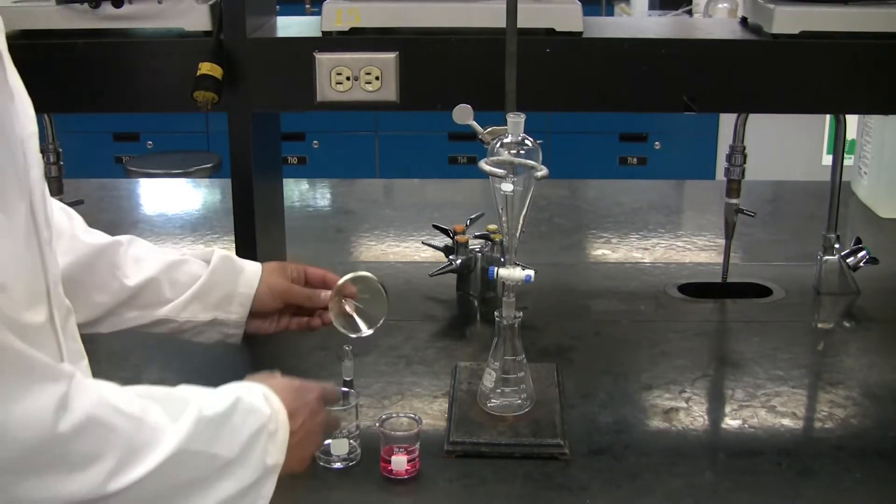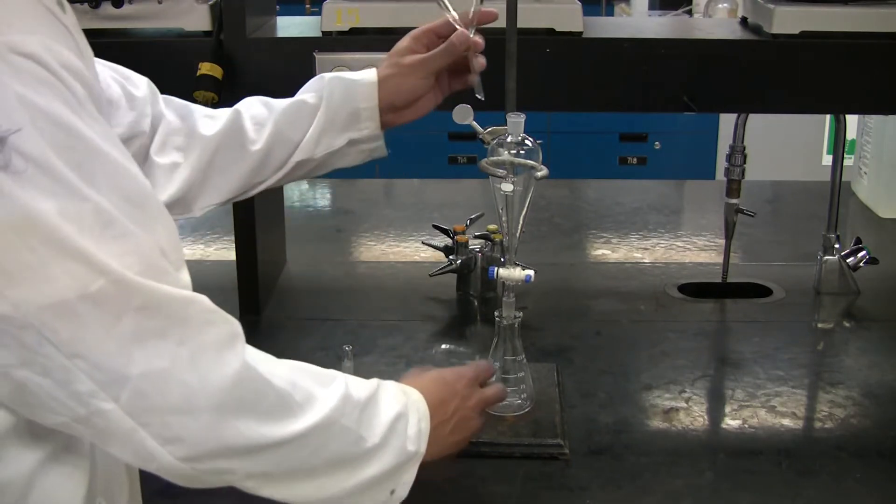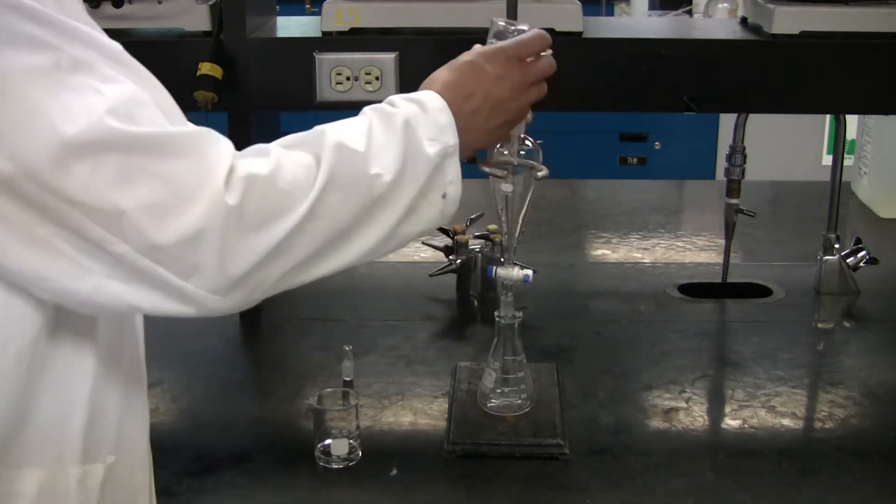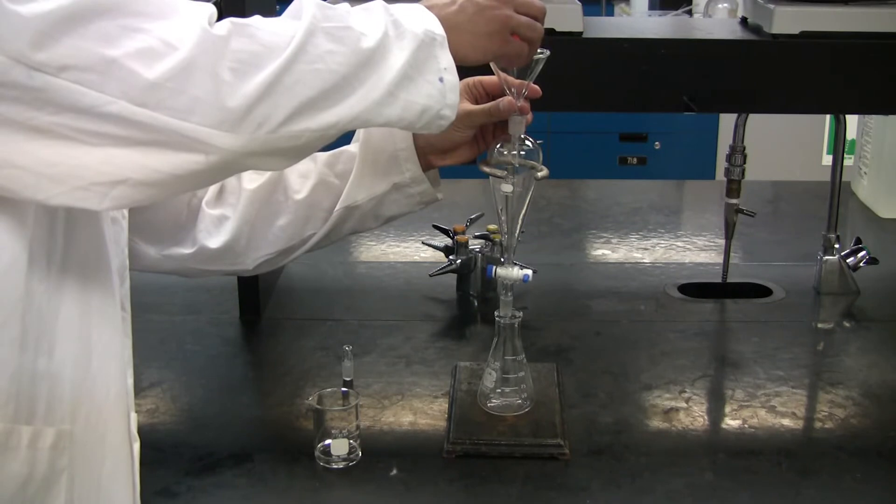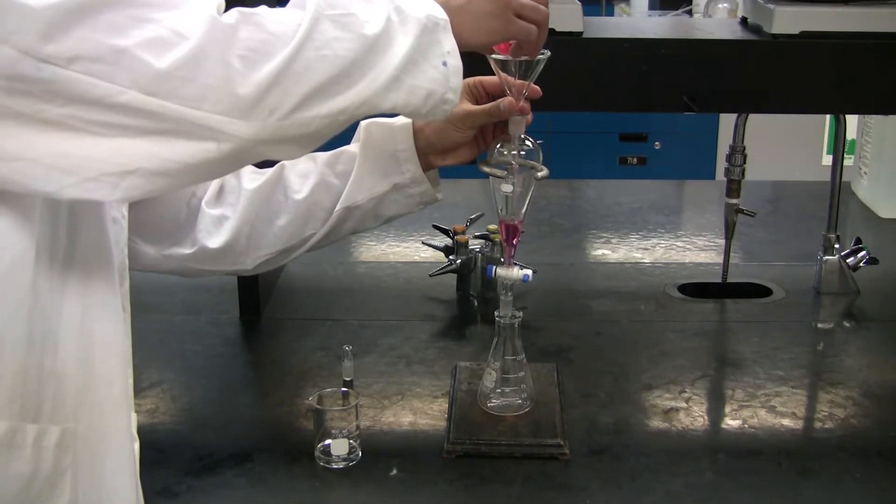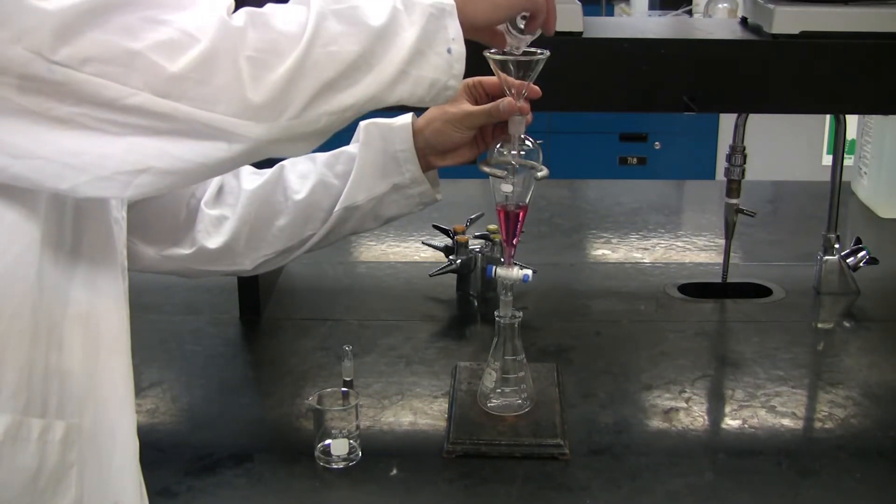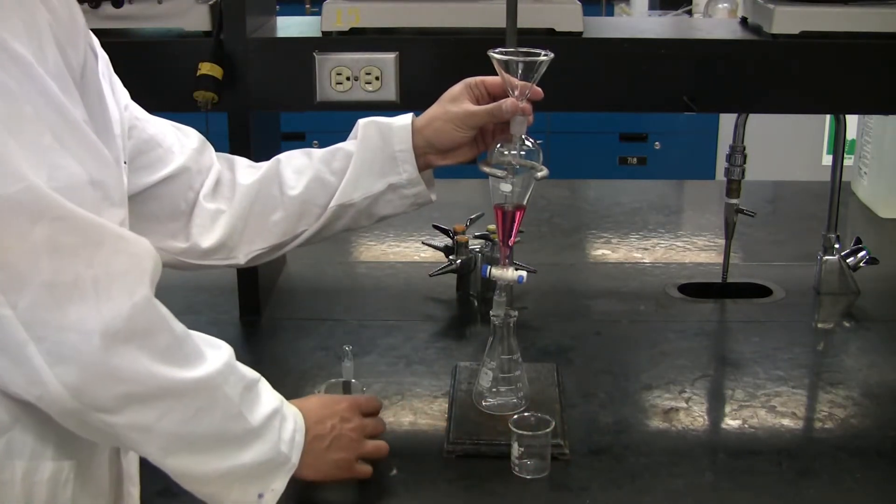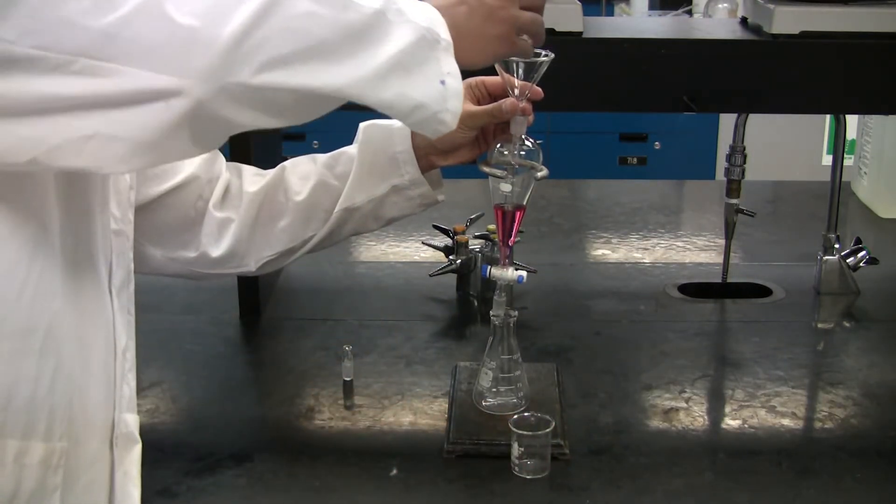Start by adding the glass funnel into the separatory funnel. Add in one of your two layers first, but make sure they are of equal quantity and the stopcock is closed before you start this. Now, add in your solvent.